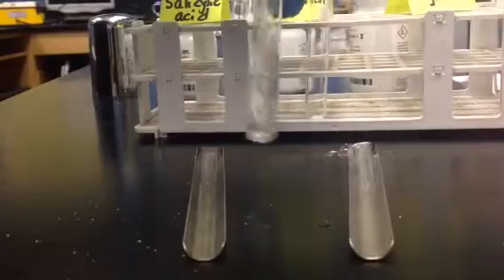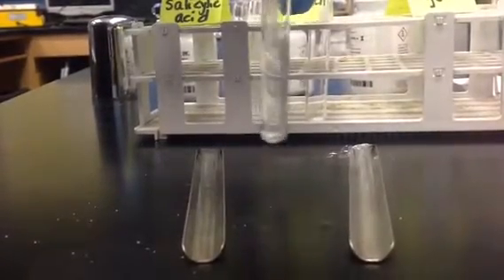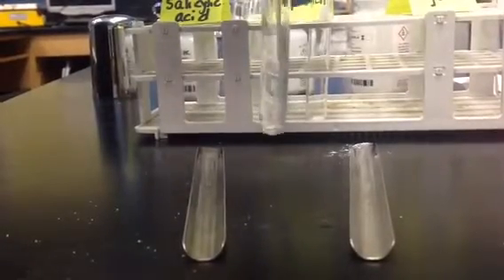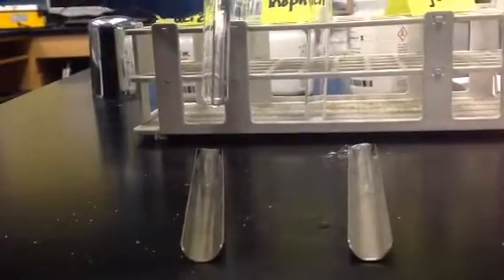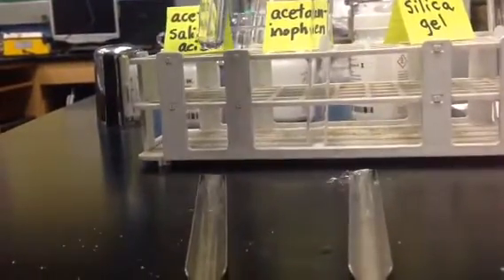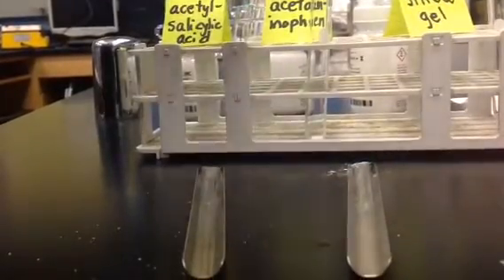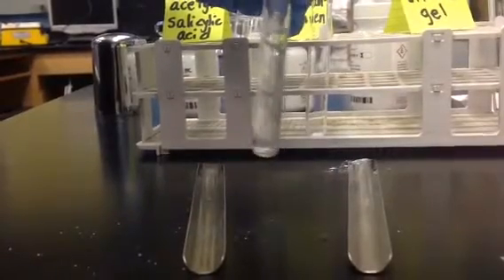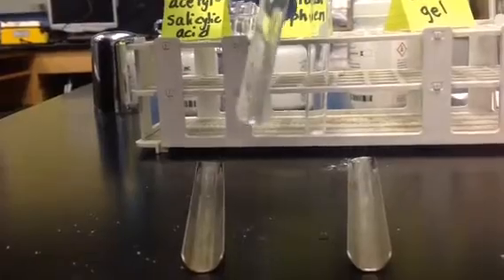So it's just going to take a lot of vigorous shaking. So you can't be timid with this, and you've got to be patient. You can't just expect when you add the solvent, it dissolves immediately. And I may have to transfer this to another test tube, a bigger test tube, to do the second part of my experiment.